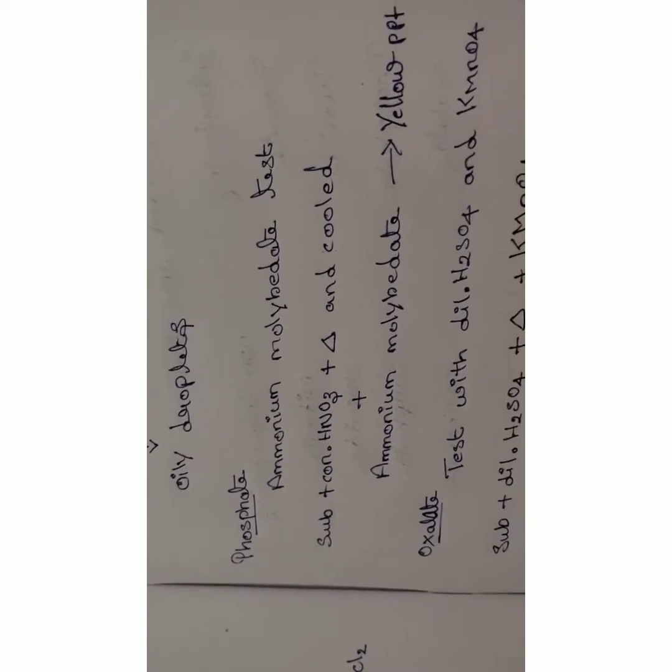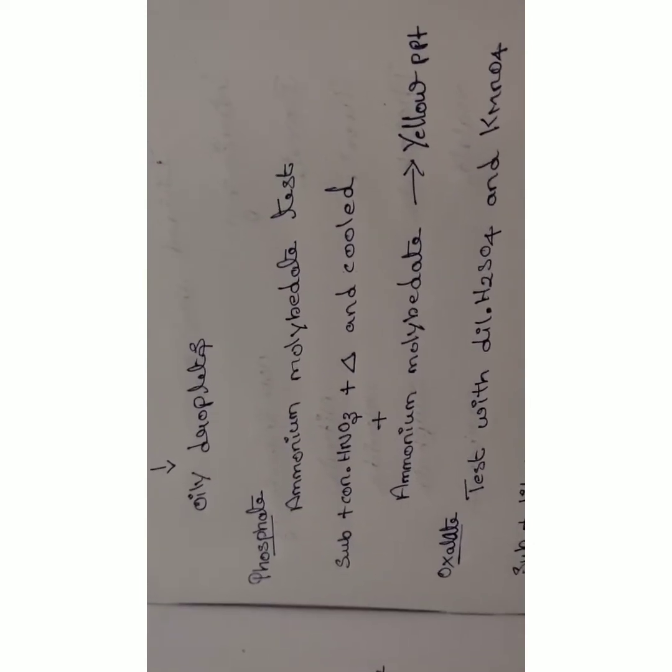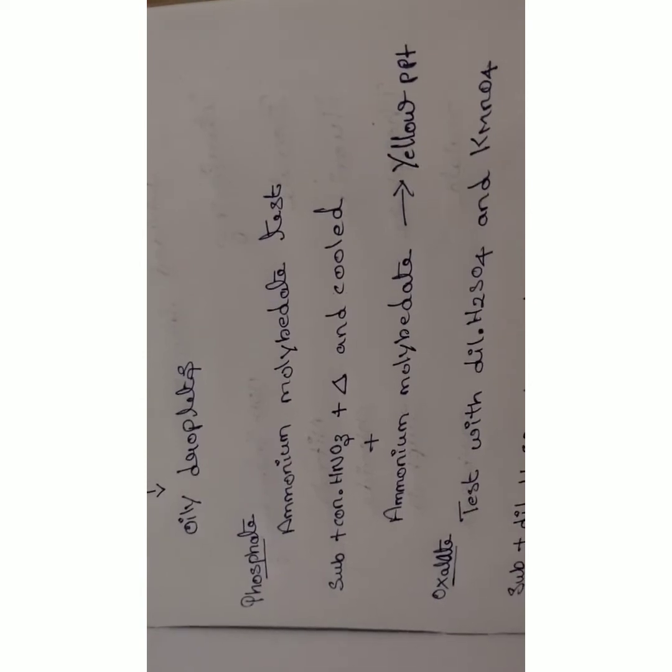On going to phosphate, the ammonium molybdate test is done to confirm the presence of phosphate. The substance is mixed with concentrated nitric acid, heated and cooled. After cooling, ammonium molybdate is added. After adding ammonium molybdate, we get a yellow precipitate, and this confirms phosphate.